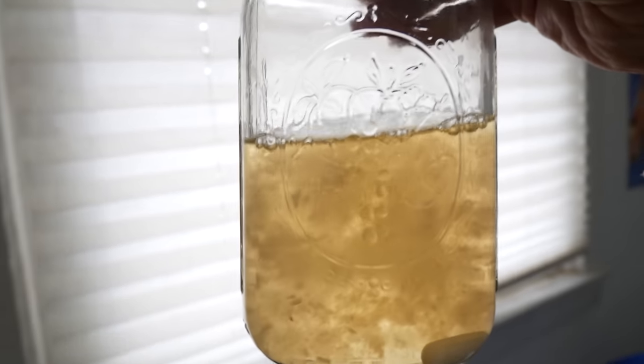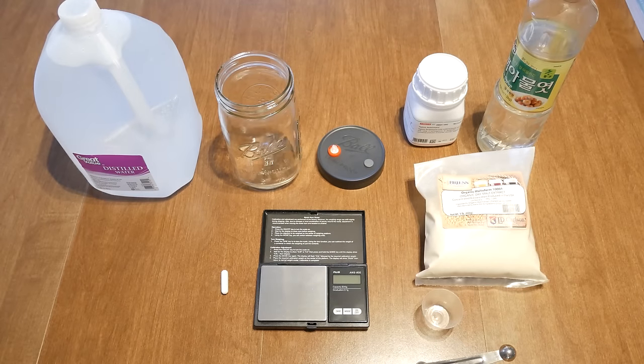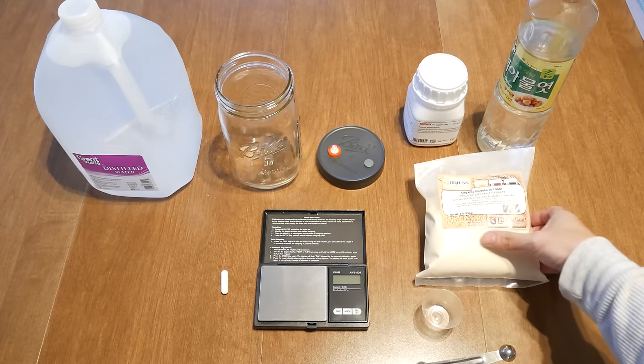I still recommend you test your cultures out on agar petri dishes to make sure they're clean. Anyhow, let's dive right into this — I'll show you guys what you would need to make this recipe.